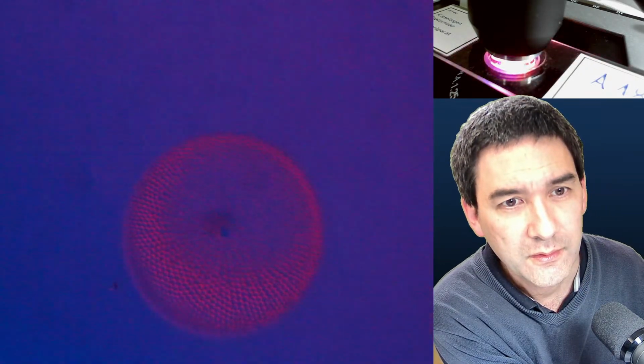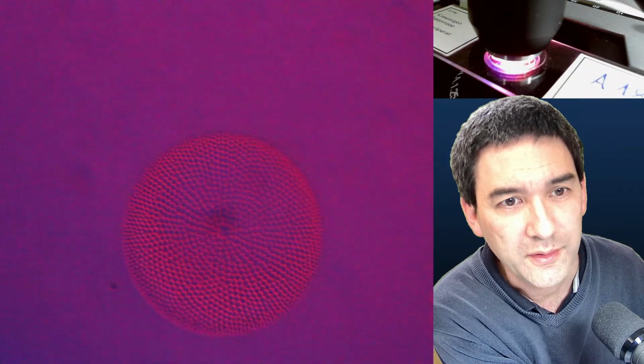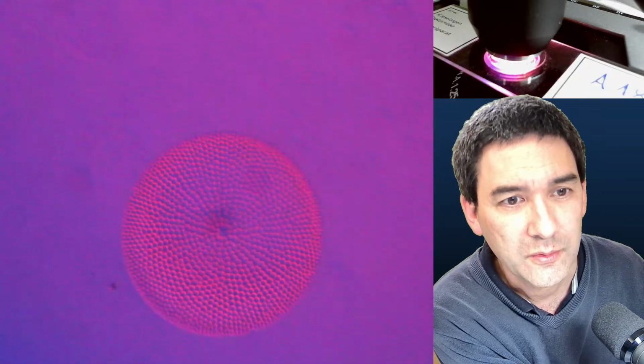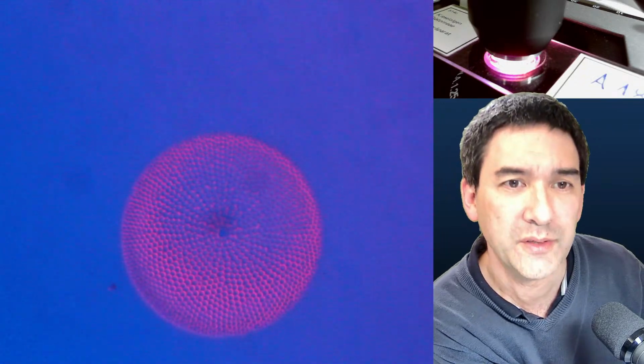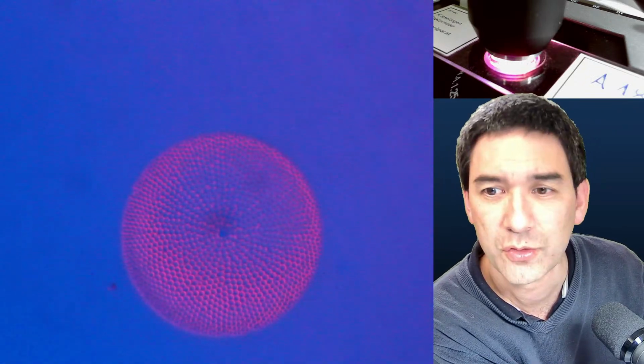And yeah, that's the red-blue one. Okay, we have to turn it up a little bit, the lamp. You get the idea. Background is blue, specimen is red.